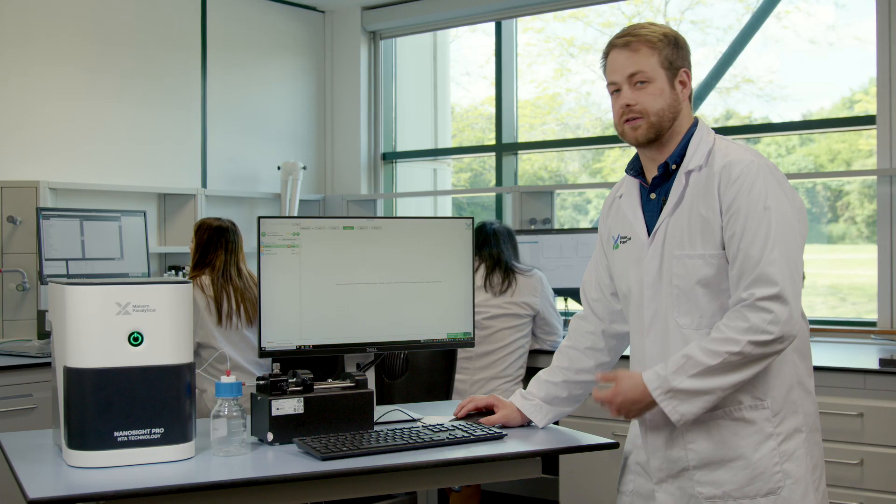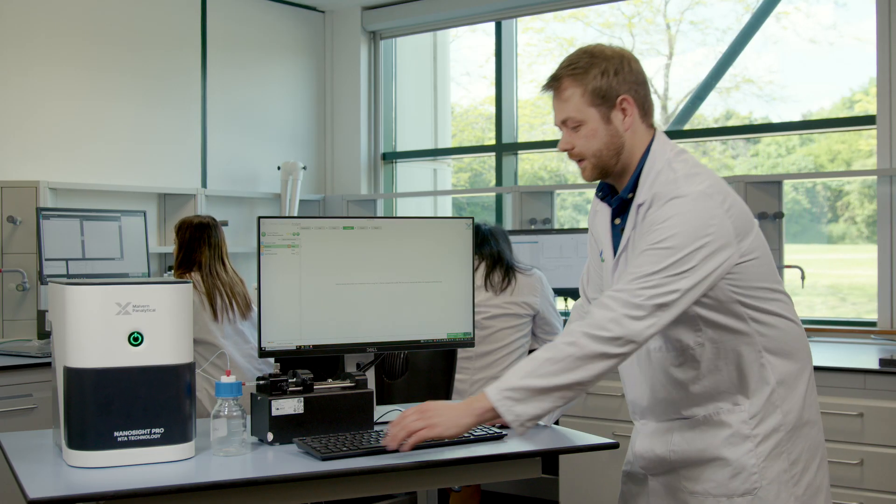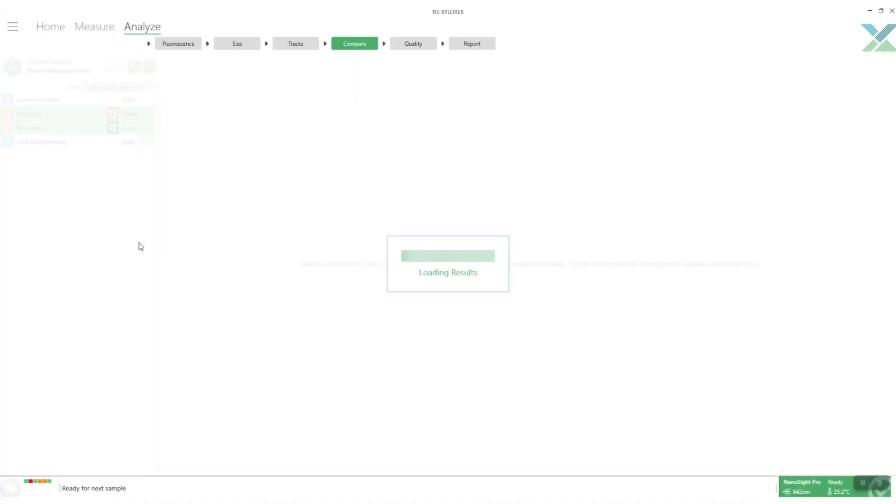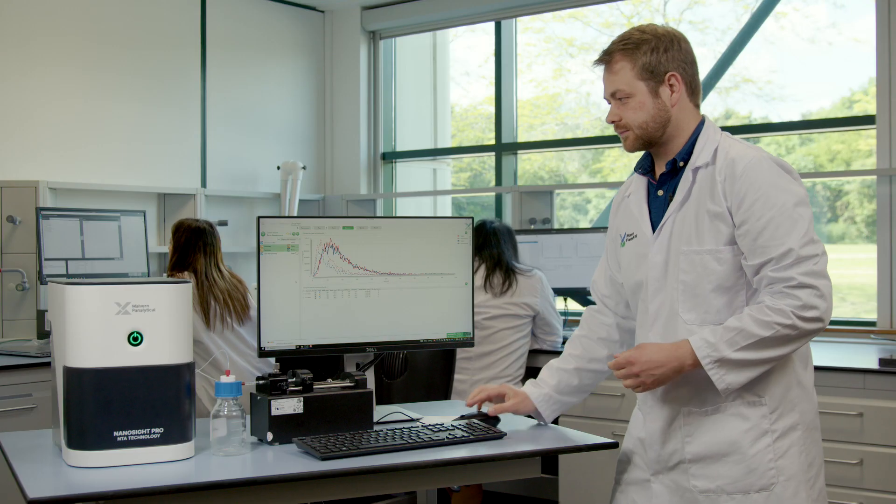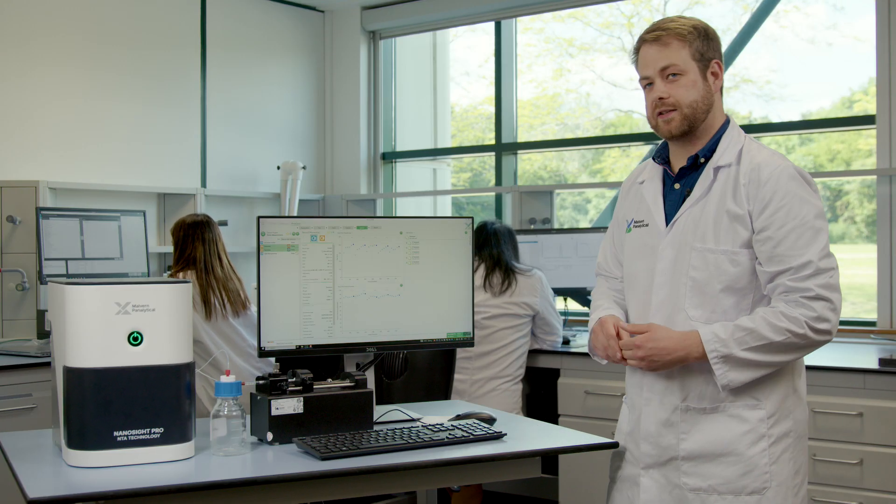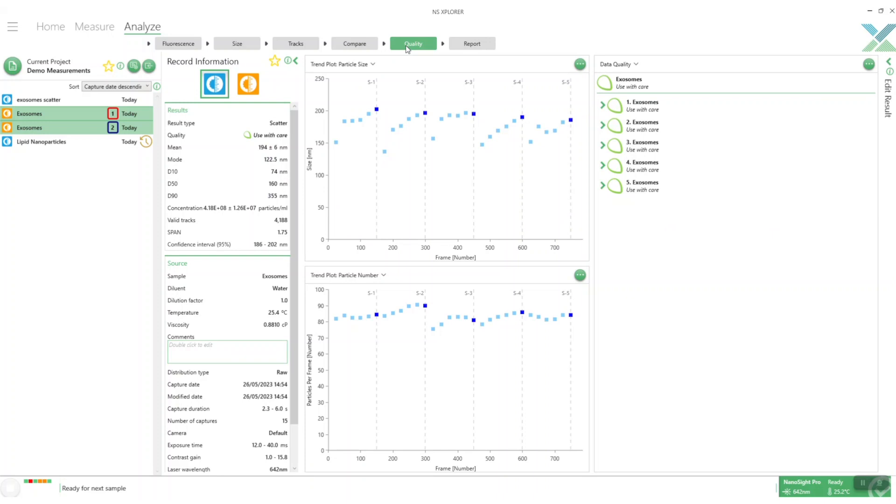We can also compare two results so we've got an exosome measurement we did earlier today and we can overlay those two and have a look at how repeatable they are. Here we've got some nice repeatability, overlay really nicely.